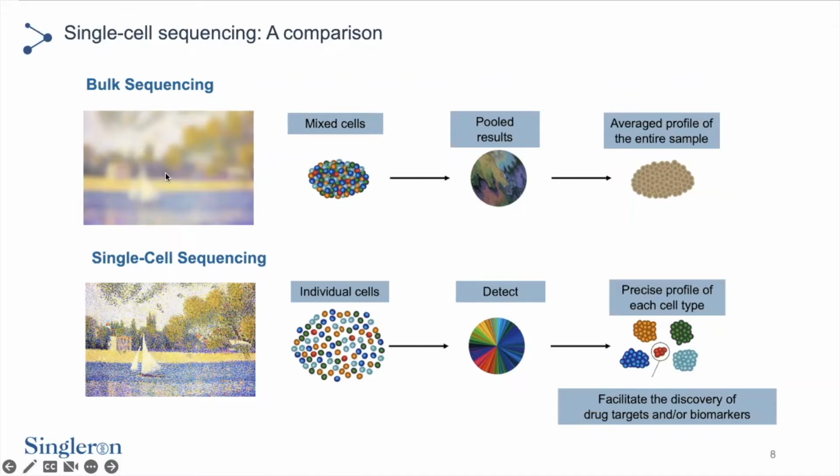So here, what you can see is that we can imagine this painting is a tissue, and each individual pixel here is a cell. So this picture consists of cells, individual pixels. But if you think that this is a tissue, the information that you can get from that would be, let's say, there are some blue cells. These are overrepresented cells.